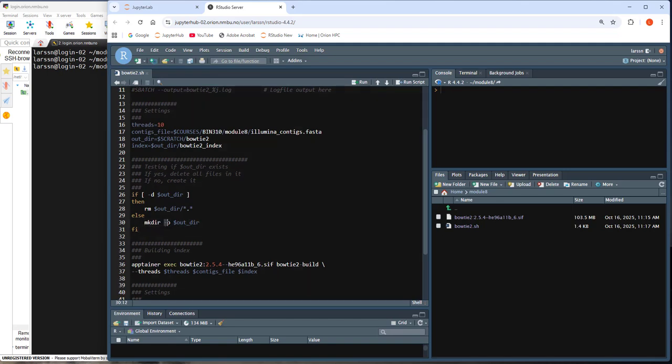The -p is for doing it recursively. So imagine you had specified a folder inside a folder inside a folder inside a folder. Then we will create all the folders down to the bottom by this -p. Otherwise, it will only be the last one. In this particular case, we did not really need the -p because the scratch folder already exists, right? So we only make one step down, and that will always be possible.